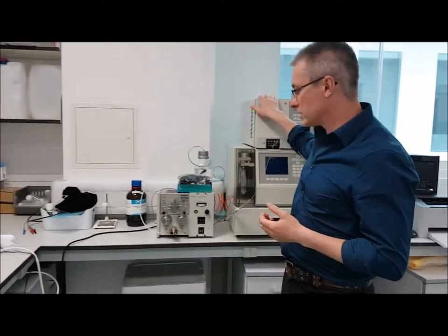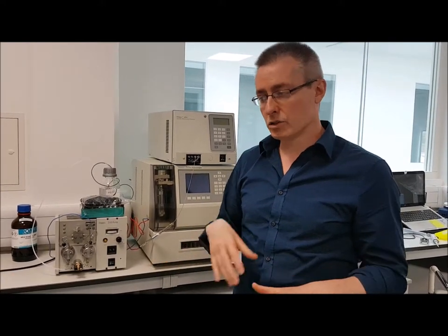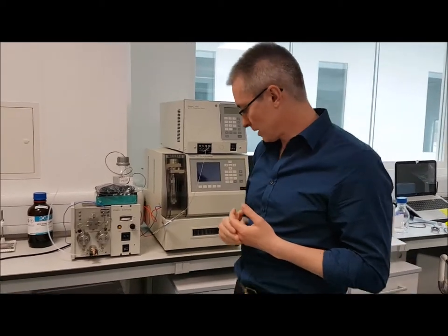We use the HPLC. There's a chilly sensor on the market, this is part of what we use for validation. But if we're going to do an assay development, it's good to do it electrochemically, and it's good to do it by another methodology. And that's why we have the HPLC as well.